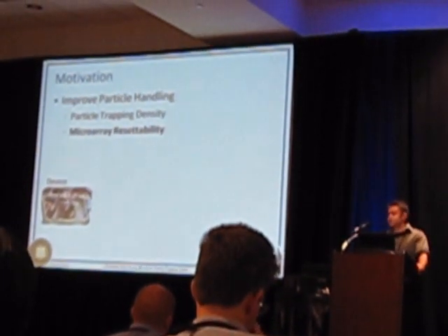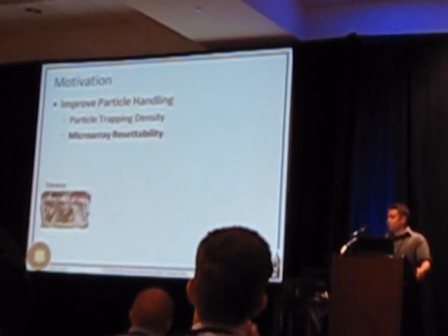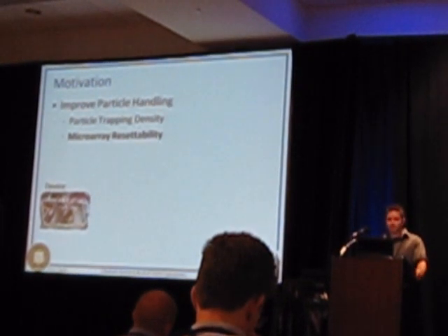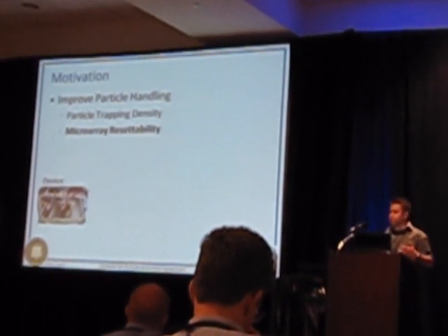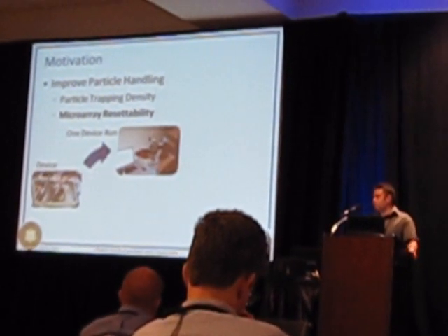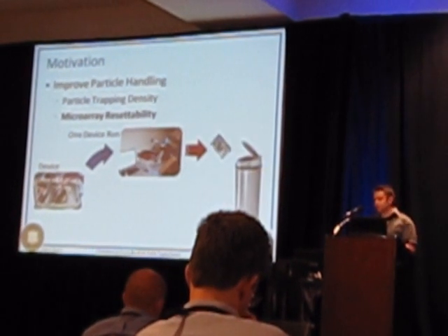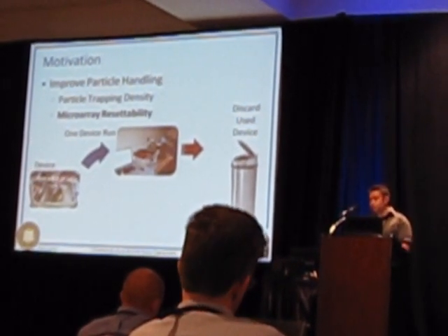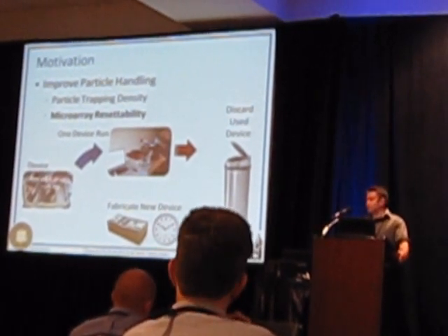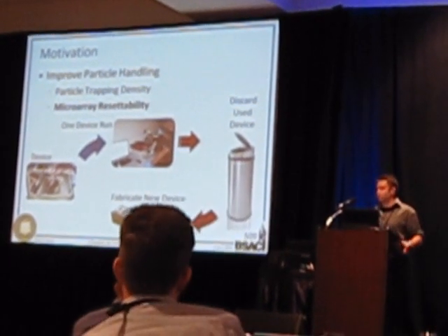So the next aspect that we focused on was achieving microarray resettability. And so this issue actually really arose from our specific process of running bead-based experiments. The way that this works is that first we take our microfluidic device, then we can run one single bead-based experiment, and then we can take that device and throw it away. Then if we want to run additional experiments, we have to spend the time and the money to fabricate multiple devices corresponding to every single bead-based experiment we want to run.